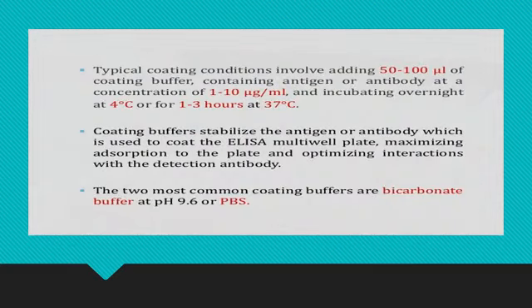طبعا إذا كنا مستخدمين بالإلايزا experiment مالتنا ال 96 well plate، each well بالبليت maximum volume اللي نقدر نحطه بالويل هو 200 microliter. فالأفضل احنا نضيف 100 microliter of coating buffer containing 1 إلى 10 microgram per ml of the antigen or the antibody. طبعا الانكوبيشن يعني maybe an overnight أو قلنا 1 إلى 3 hours، يعتمد على البروتوكول.